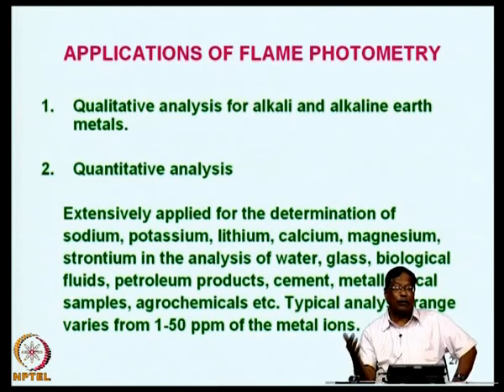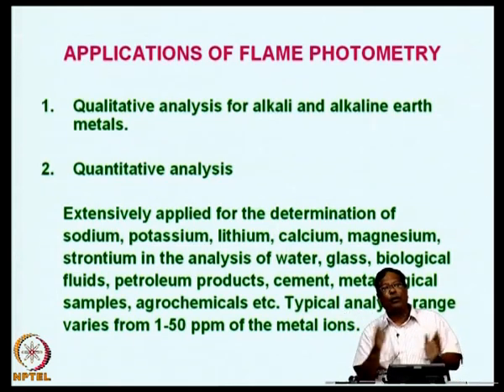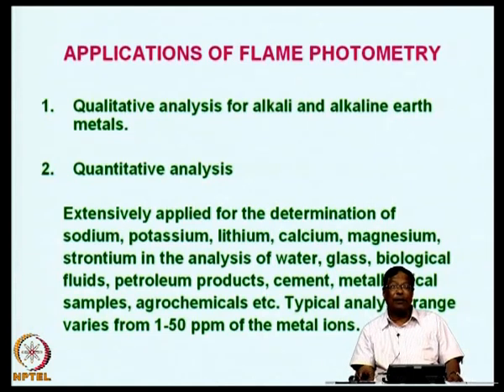Only thing is they are not used for quantitative analysis, because for quantitative analysis you will have to correlate the flame color with the concentration.